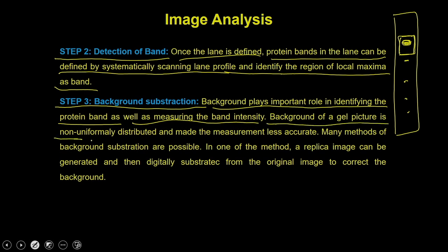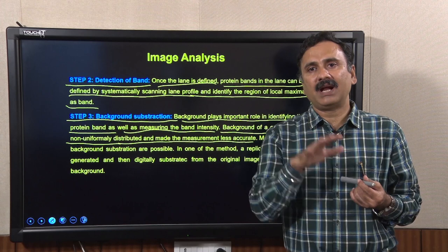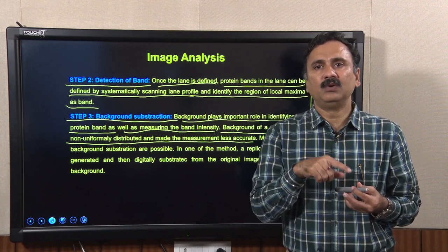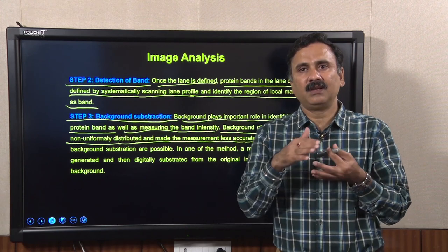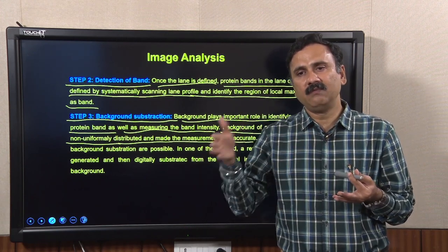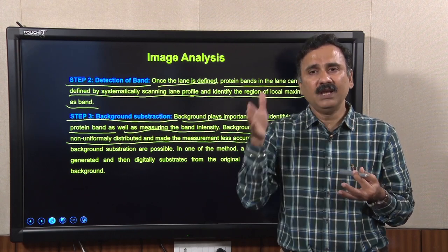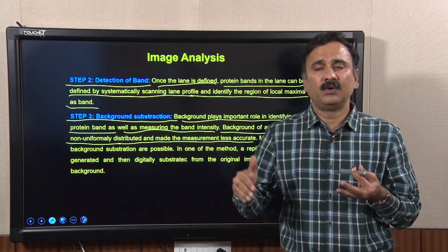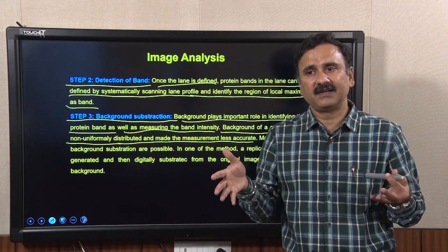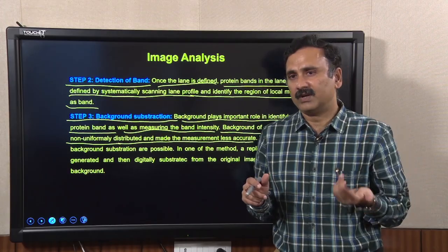The background of a gel picture is non-uniformly distributed and makes the measurement less accurate, which means if the background is uniform, you are going to see the measurement be more and more accurate. But if the background is non-uniform, that is going to bring more and more trouble, because the software doesn't know what is your intensity and what is your background. So if it is a uniform background, it is going to give you more uniform numbers, which means it is going to assign very comfortably a 0 to every lower intensity pixel. But if it is non-uniform, then it will not be able to judge where the intensity of the spot is starting, where your band is existing within the gel. So that is going to make the measurements more and more erroneous.